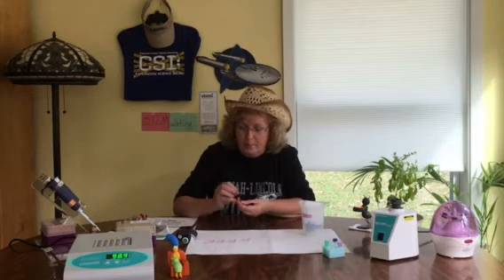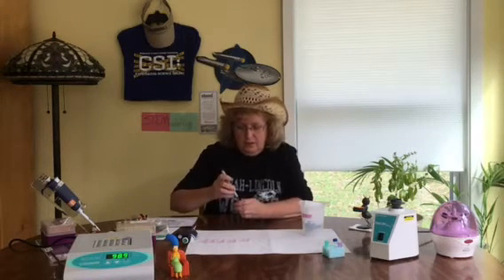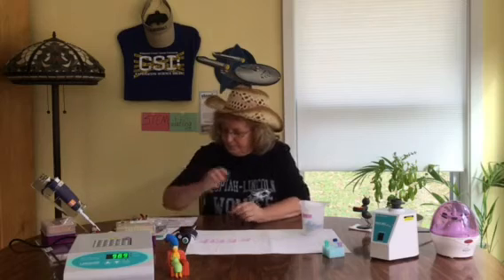I've got an ant, I've got a flea, I've got a mosquito. I hope it's an Aedes albopictus with the little stripe down its thorax, the little Asian tiger, but it may be a Culex or it may be an Anopheles. Nasonia negative, Nasonia positive. So you can get those labeled.